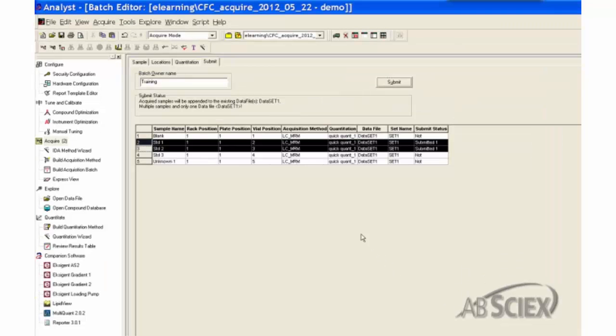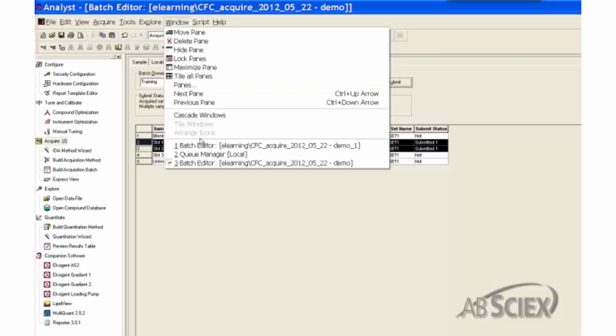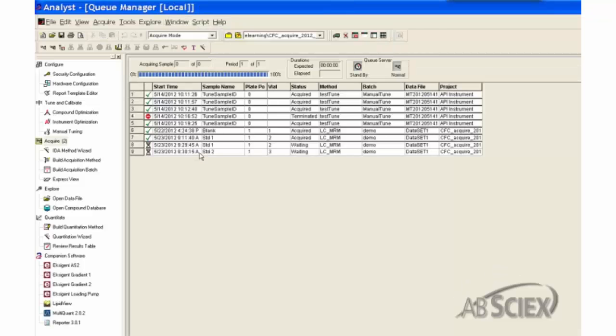When a batch of samples have been submitted to the sample queue, they are shown in the sample list of the Queue Manager window with the status Waiting. This is because the queue by default is stopped until you manually start it.